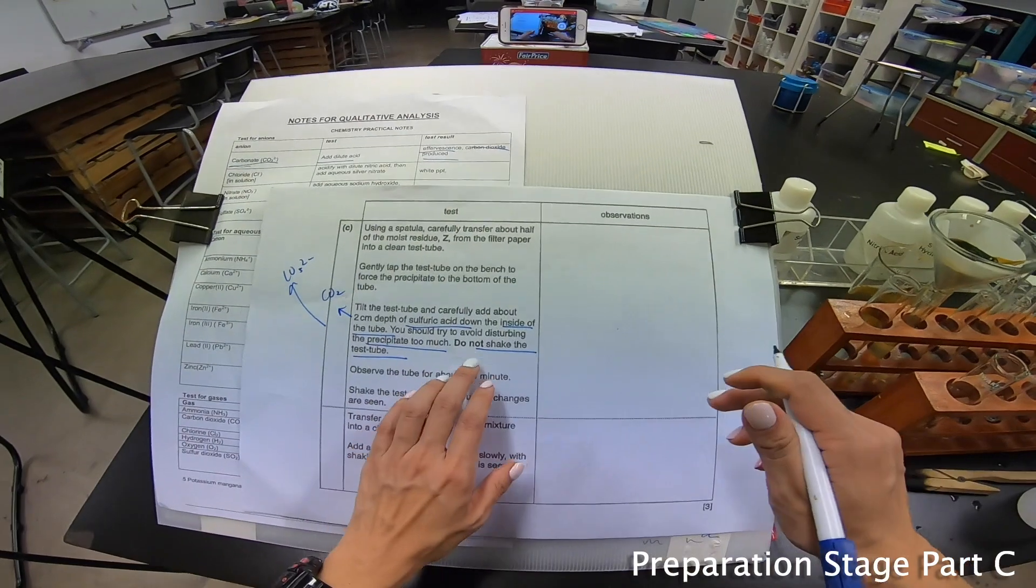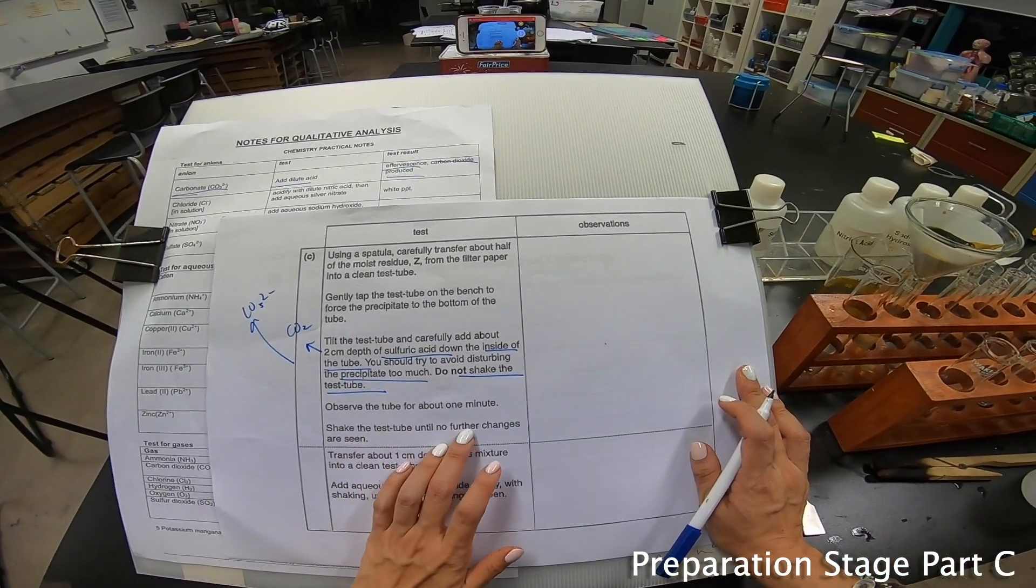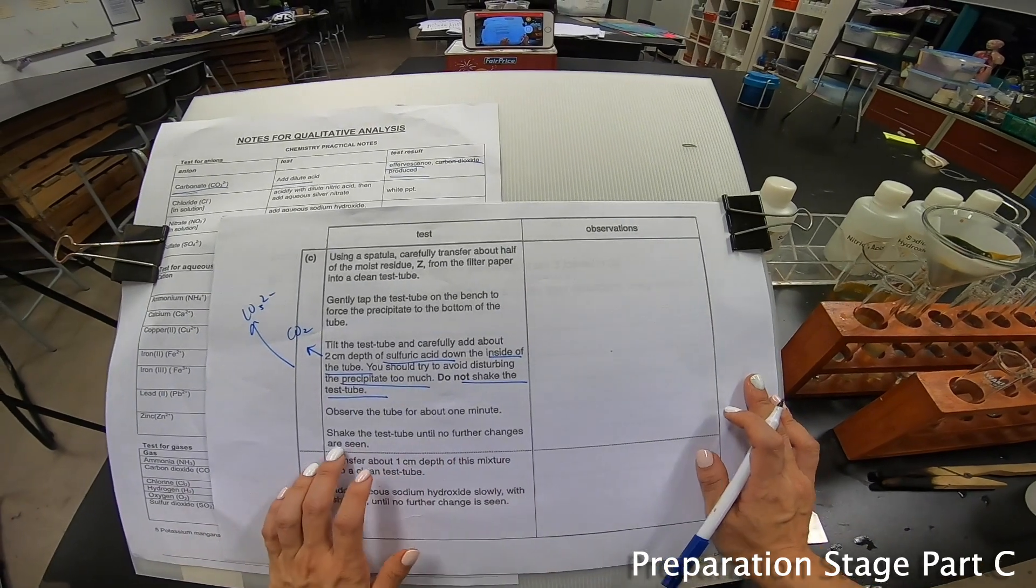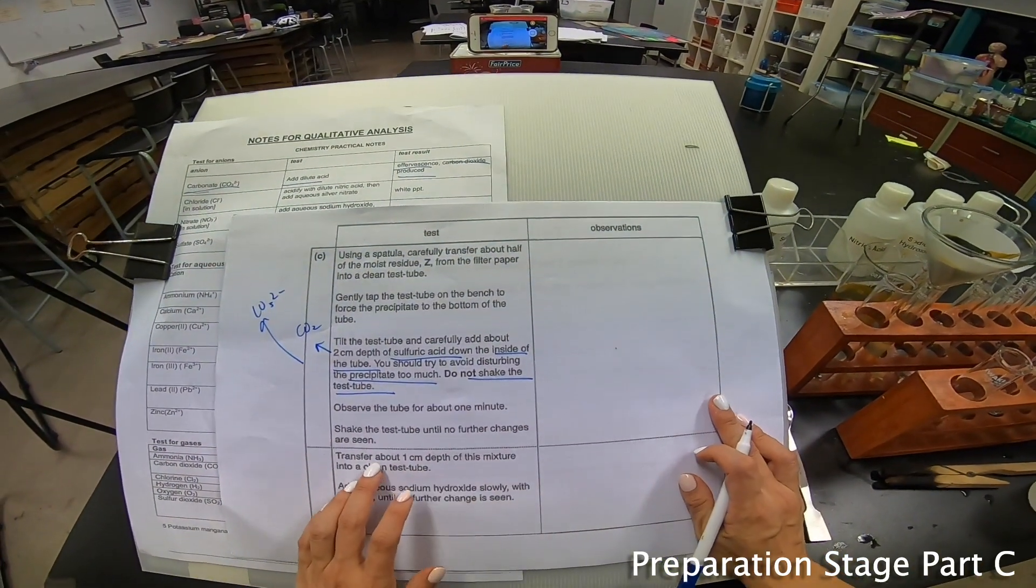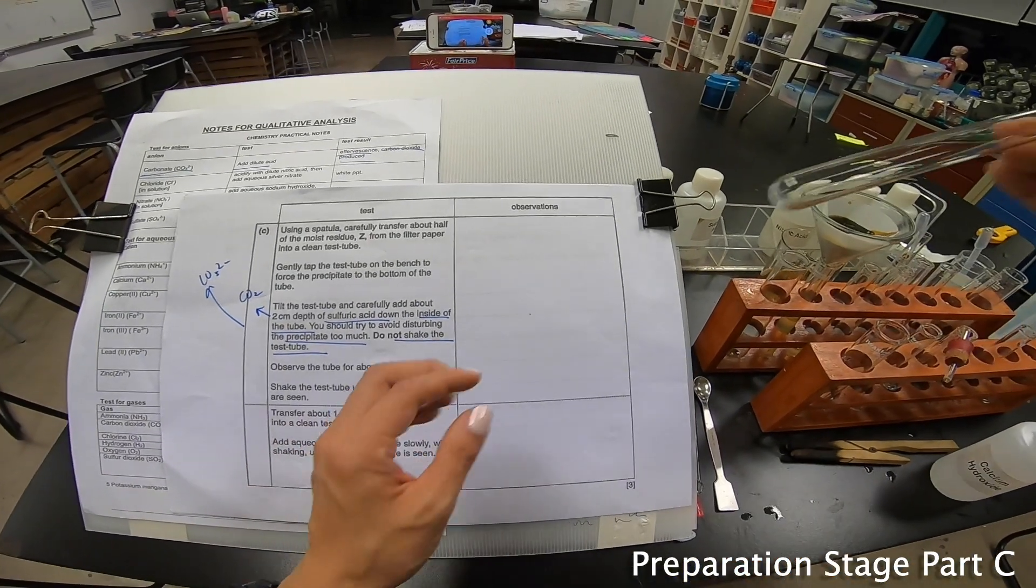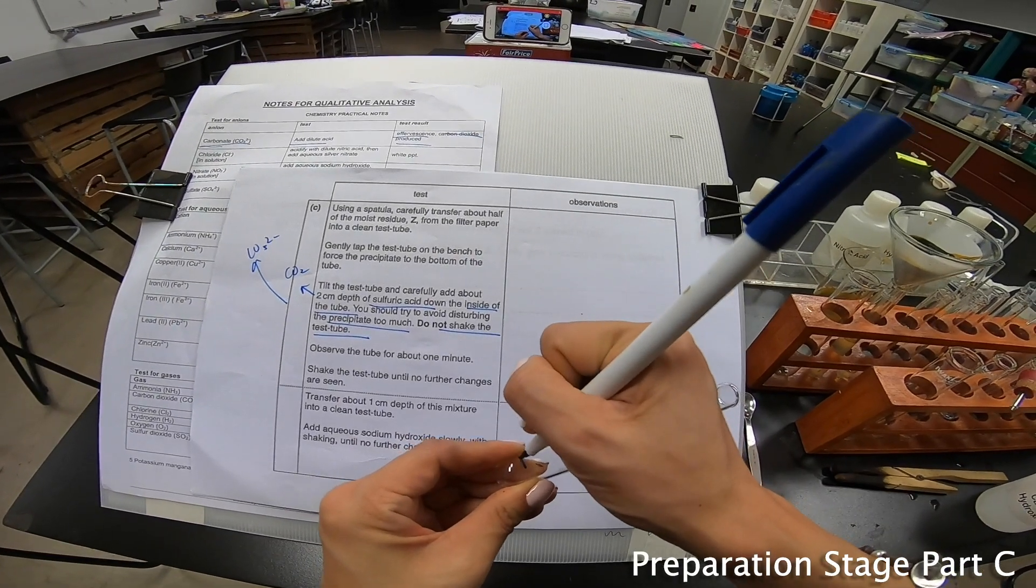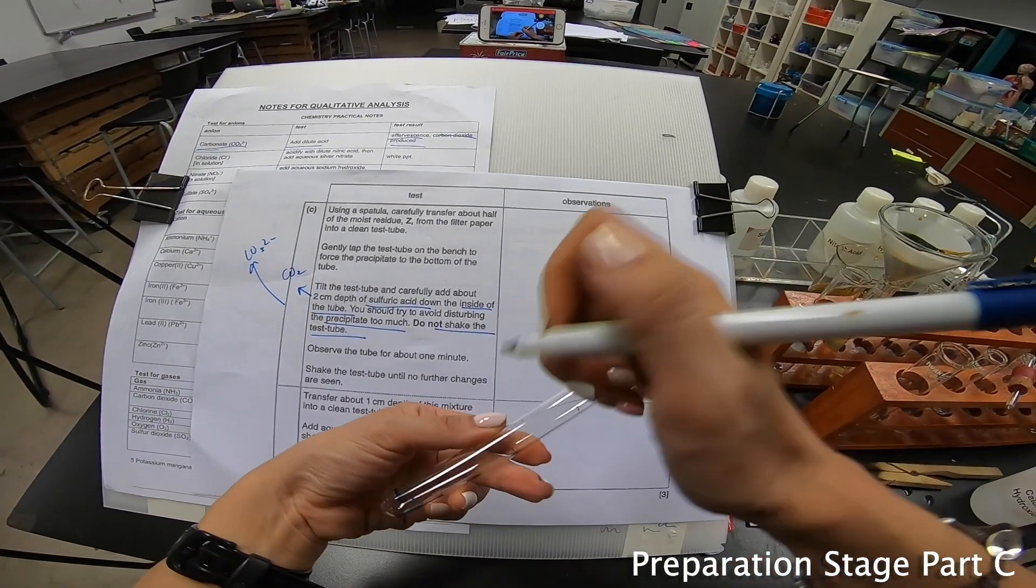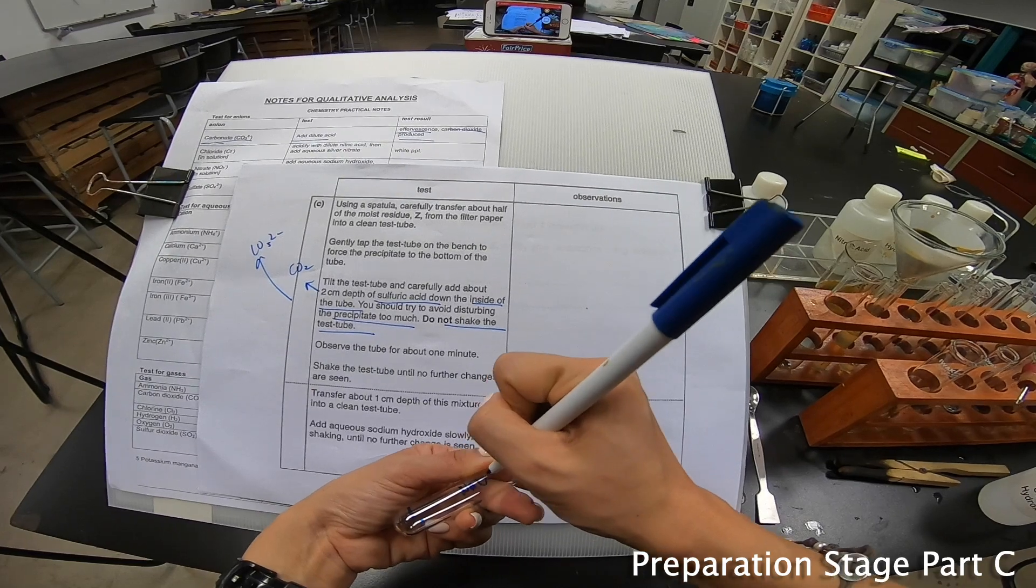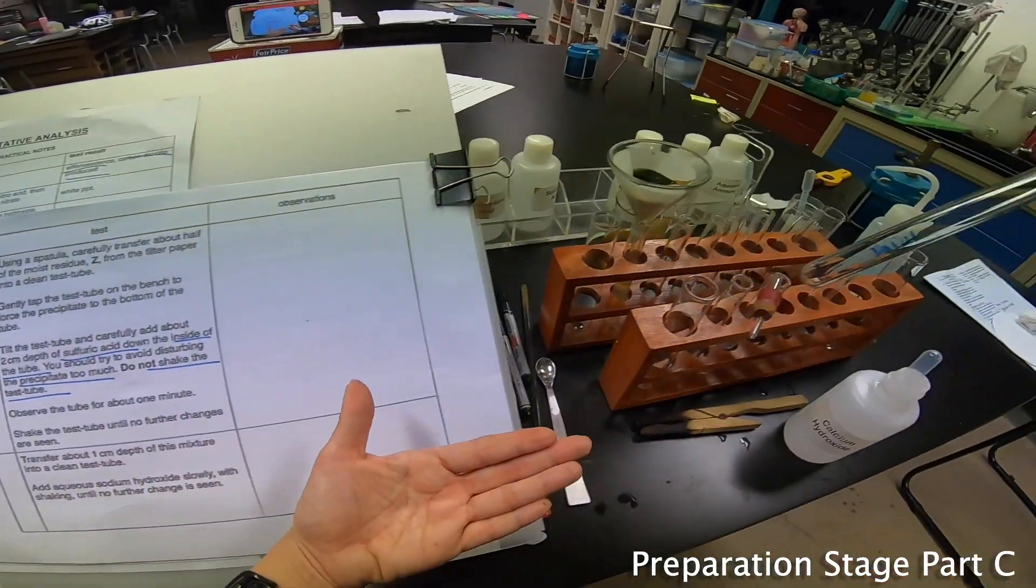They say observe the tube for about a minute. Shake the test tube until no further changes are seen. That is this portion here. Next portion, transfer about 1 cm of this into a clean test tube, and then this part you add sodium hydroxide. Do it with shaking without further changes seen.